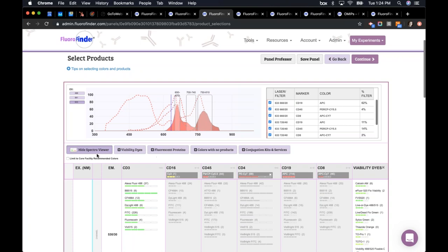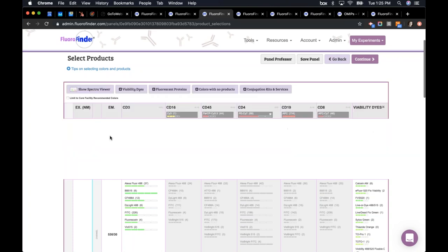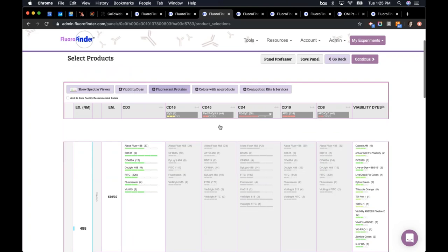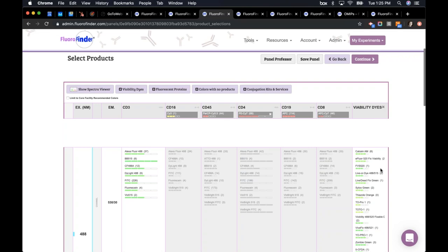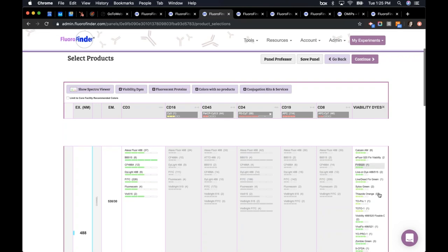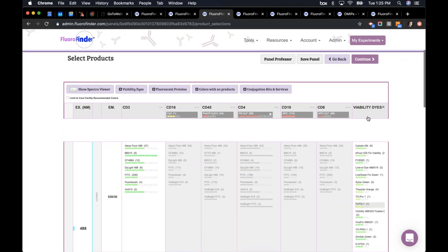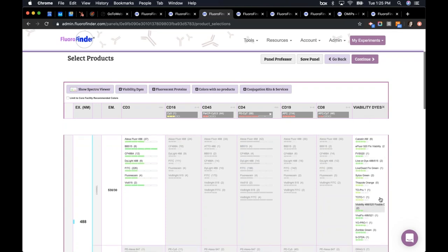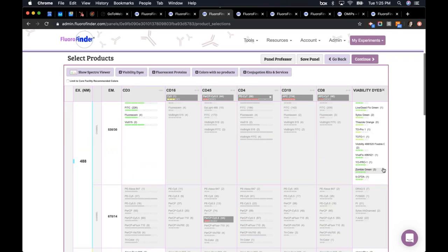In addition to the Spectra Viewer, we have the Viability Dyes button. Clicking it adds a whole separate column on the right-hand side showing every viability dye in the FloraFinder system and which channel each one is optimal in, making it easy to select a viability dye as you go through the panel building process. If you're doing fluorescent protein work, use the Fluorescent Protein button to add all fluorescent proteins into this matrix.